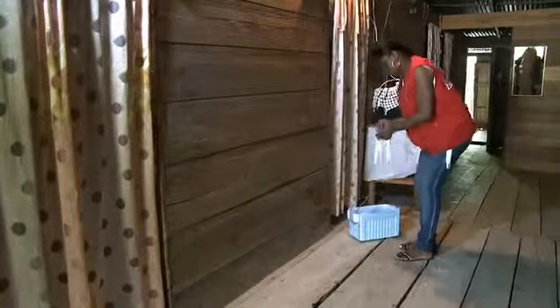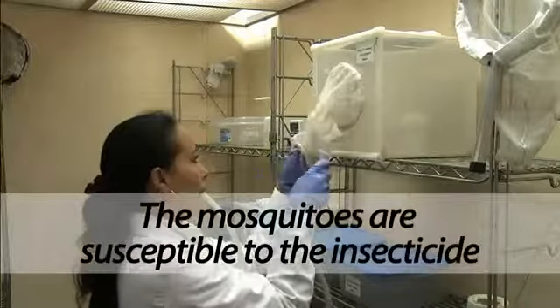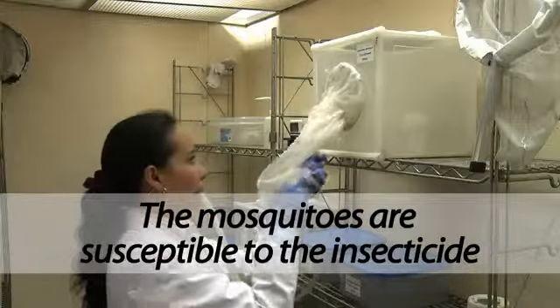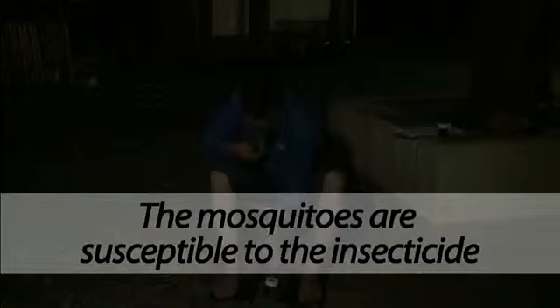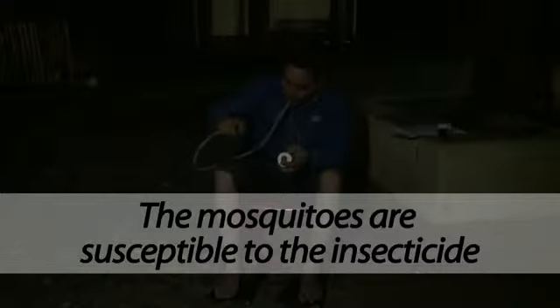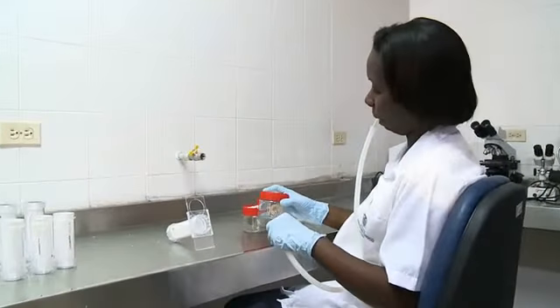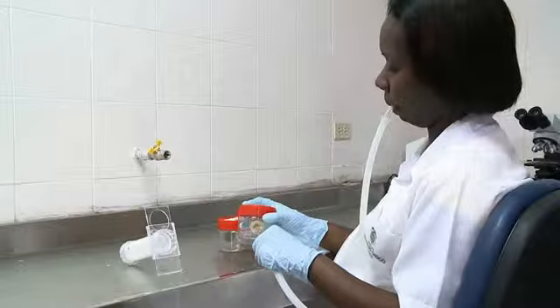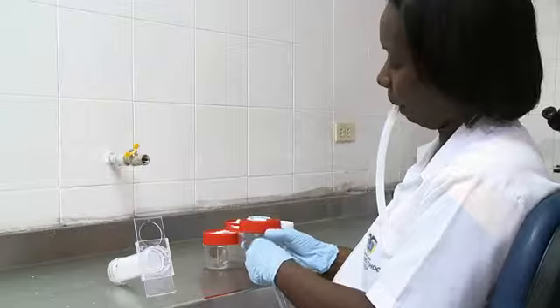There are a few general considerations to be aware of before starting. These include: usually fully susceptible mosquitoes reared in an insectary are used in the evaluations. Where this does not exist, then it may be necessary to use field-caught mosquitoes for the test, although it is less than desirable. In this case, it is important to determine that the field-caught mosquitoes are fully susceptible before conducting the test. To do this, follow the standardized protocol for susceptibility evaluations, which is to raise field-caught larvae to adults.